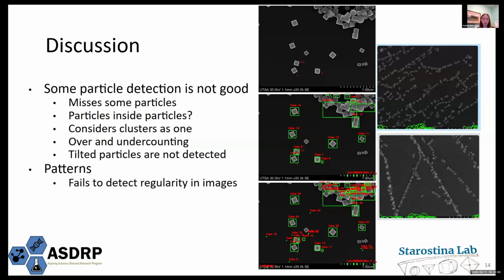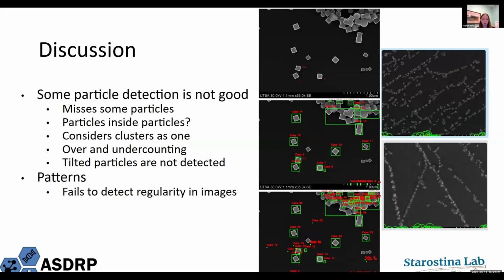So I've been trying different methods to be able to correctly identify the background. Identifying the background helps especially because in the beginning, they would try to identify the background as a particle instead of the actual particle. So that's one way I've been trying, and then also switching the order of steps and trying to see if that helps with it.